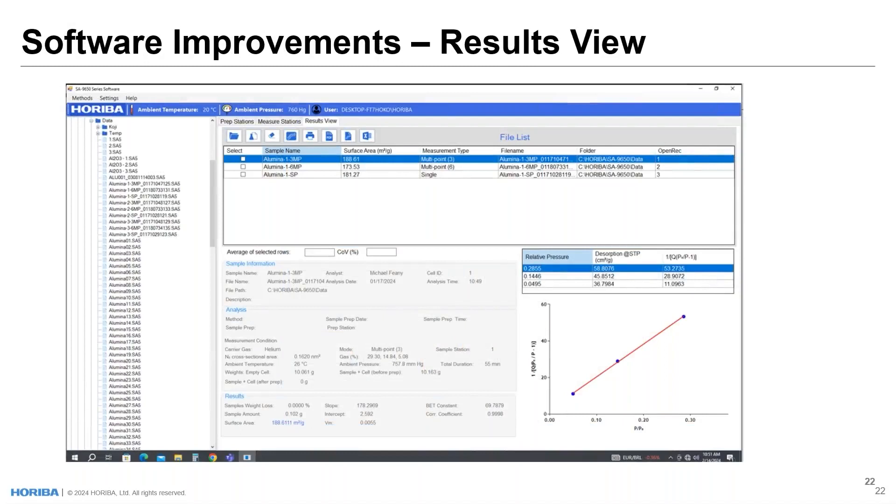The results view is a new addition. You can have as many sample files as you'd like available in the left panel. Selecting those files displays the sample information, surface area, and related data. A selected file shows sample information, analysis information, and results information. For a multipoint three-point analysis, we see a BET plot and the raw data from that BET plot. You can select multiple files to automatically average results and get coefficient of variation. You can also select multiple files to generate overlay plots, print analyses, generate PDFs, and export files to Excel or as text files.